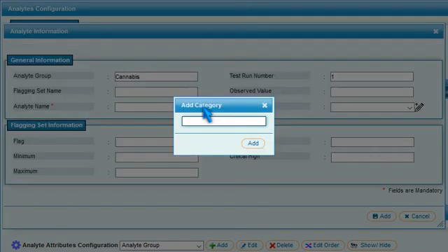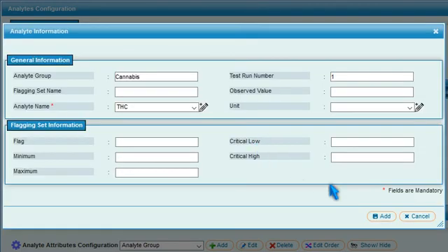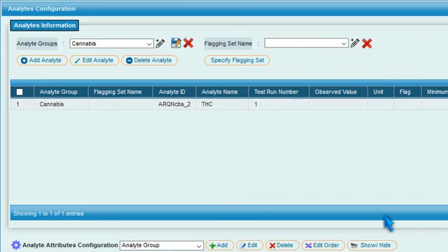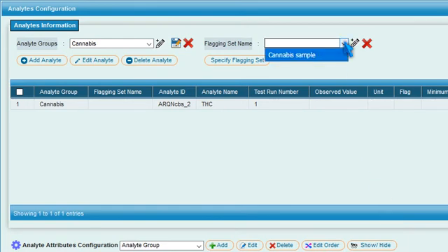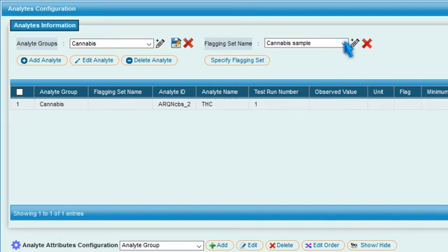Press Add to save the information. To flag a test based on abnormal test results, select a flagging set name from the drop-down menu or click Add Category icon to add a new flagging set.